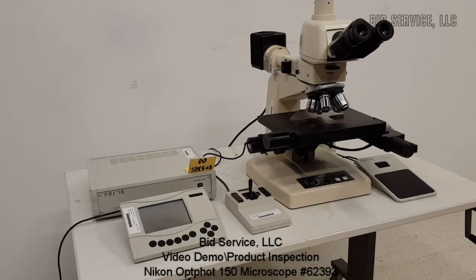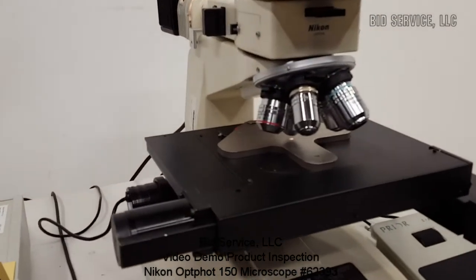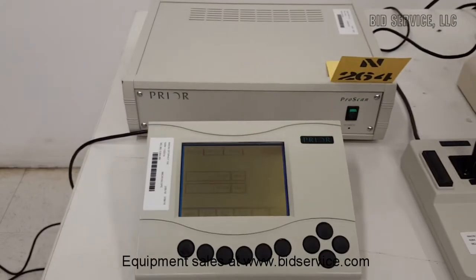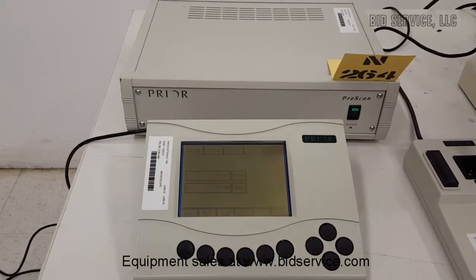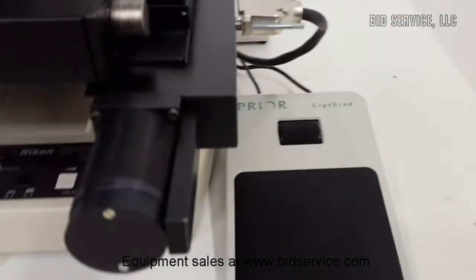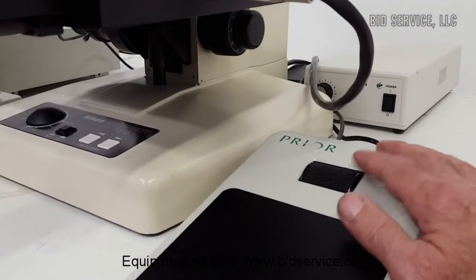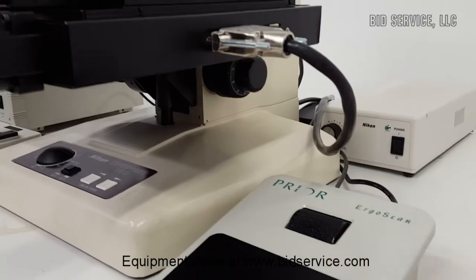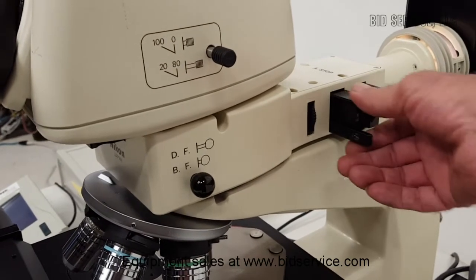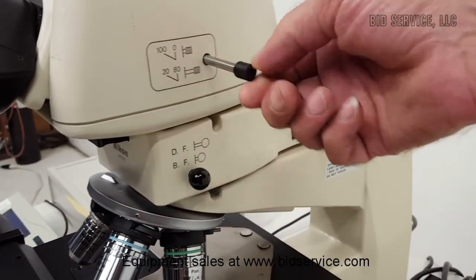This is the Optifot 150. This is the prior stage controller. Joystick. Fine focus knob. Here's the A-stop block. Rotate and polarizer. Bright field, dark field. And camera port.